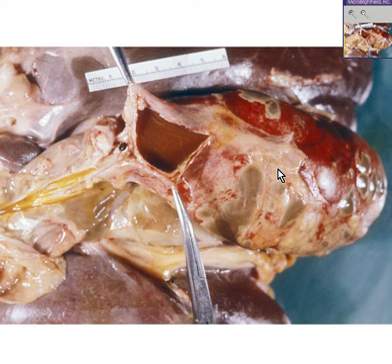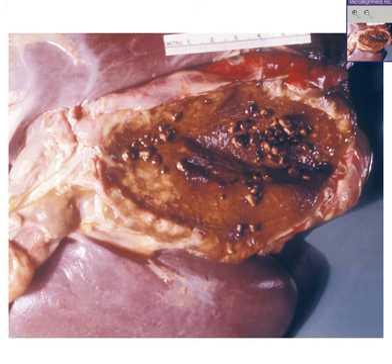This case is called acute cholecystitis. Notice that there is some junk inside the gallbladder, and when we open it up even more, this winds up being a combination of sludge, bile, pus, fibrin, and you can also see that the yellowish fibrinous exudate extends through the wall to the surface, and parts of the surface is also very hemorrhagic.